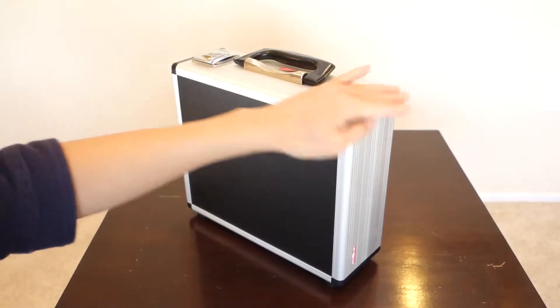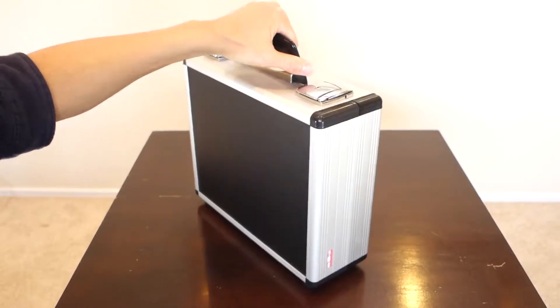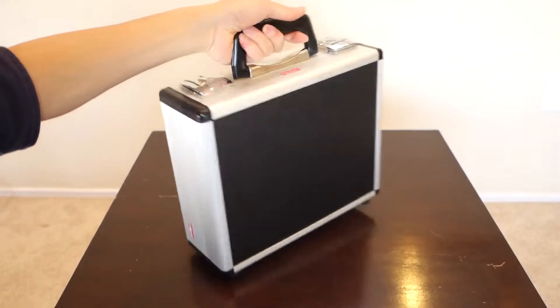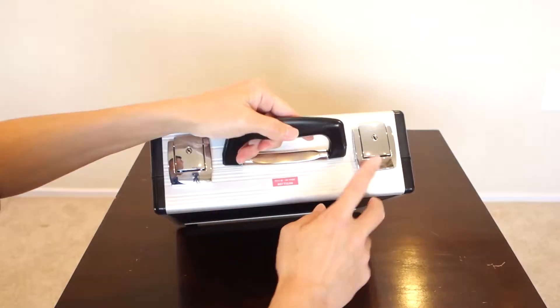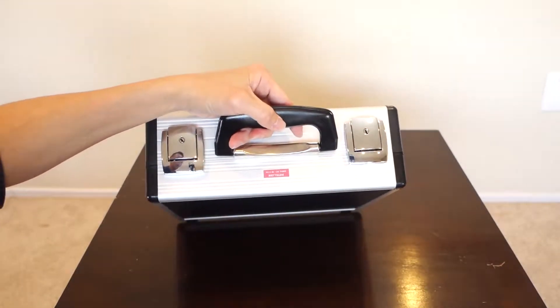It comes in a steel case, and it's very sturdy. It's got a handle here so that you can easily carry it around. It's got these locks on both ends, so if you want to keep it secure, you can keep it locked.